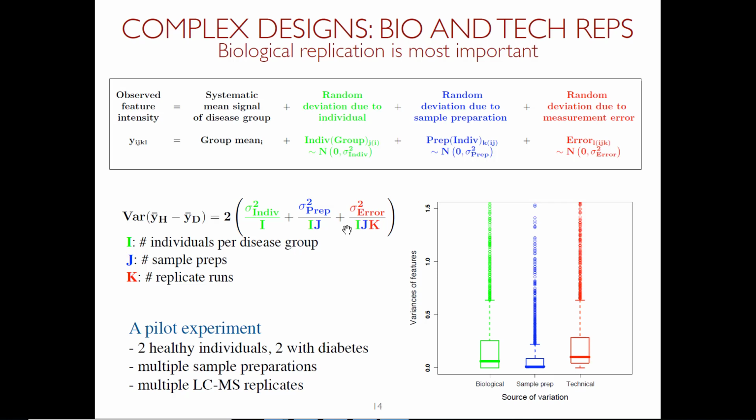A very common misconception is that I can tell you to just use 3 subjects, don't you worry. No such thing. It's not possible, because it really depends on what you're trying to do: what's the variation in the biology, what's the variation in the technology. And I must also add that it's person-specific. The same biological system and the same mass spectrometer in different hands will look different. These are very sensitive technologies, and small changes can have big effects. So I would argue it's also specific to the person doing the experiment.